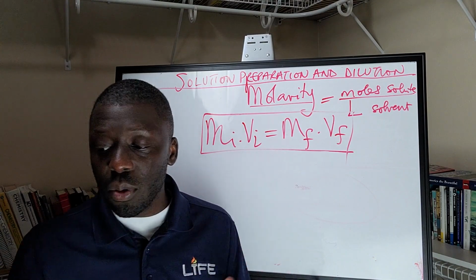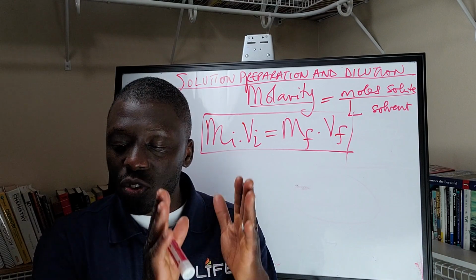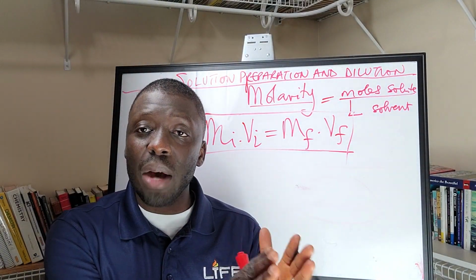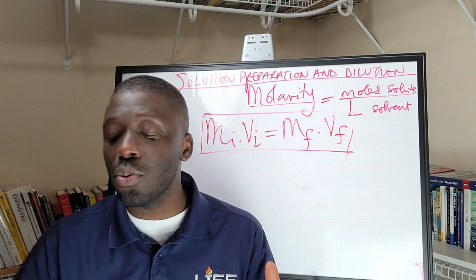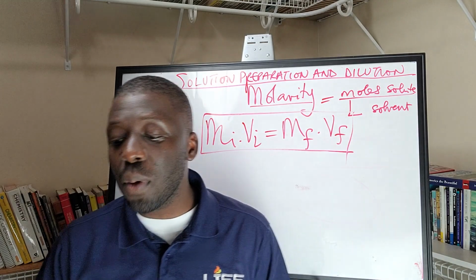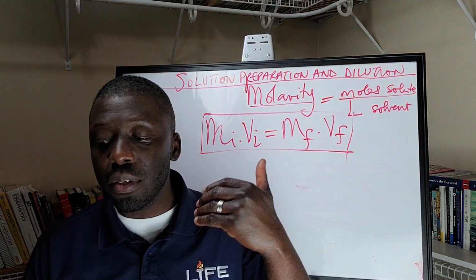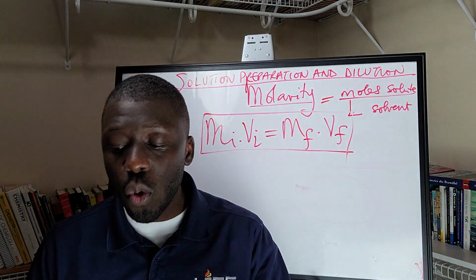You will have a table with 5 test tubes, where you start with a certain concentration and see what happens as you move a certain amount of liquid from one test tube to the next, and so on. That's part of what you'll be doing in this lab with dilutions. It's a very important skill to have. So show your work, please.